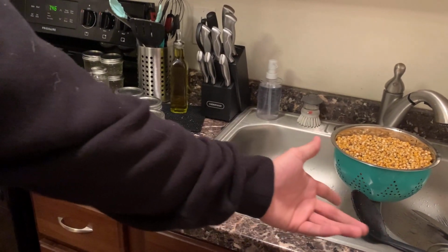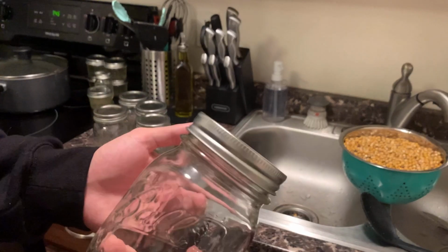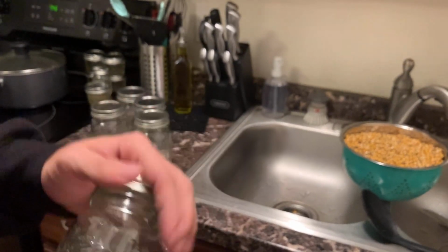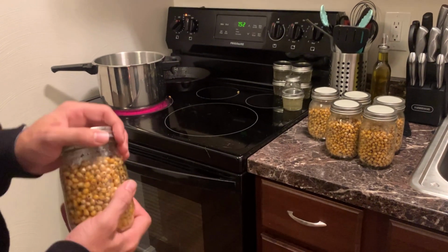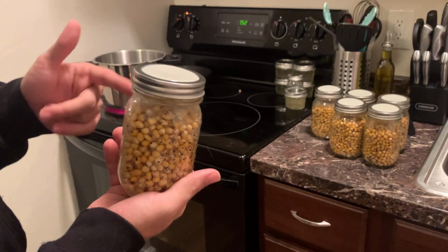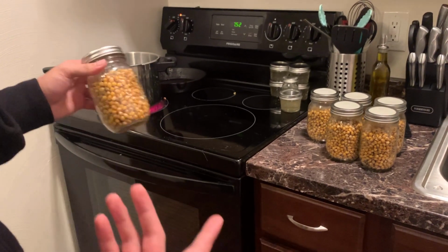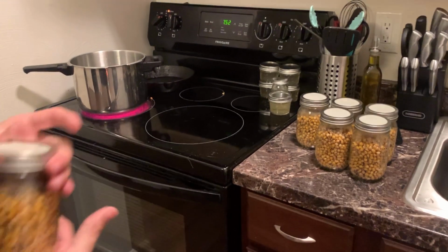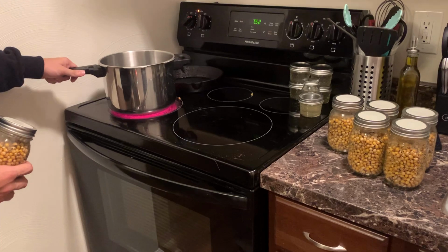So I'm just gonna use a little spoon I got here and fill these up, and then we're gonna pressure cook it. I'm gonna cut this part out so I don't waste y'all's time. All right, so as you guys can see, those 5 half full mason jars of the raw popcorn turned into 6 full jars, just like I wanted it to. So the next step is me sterilizing our spawn with a pressure cooker.